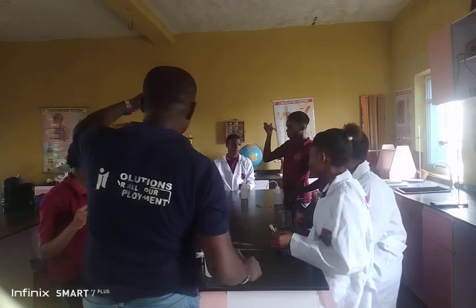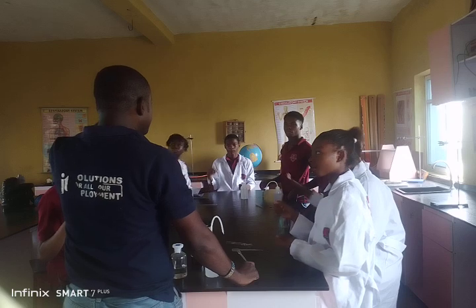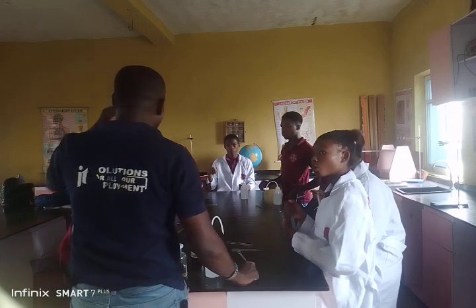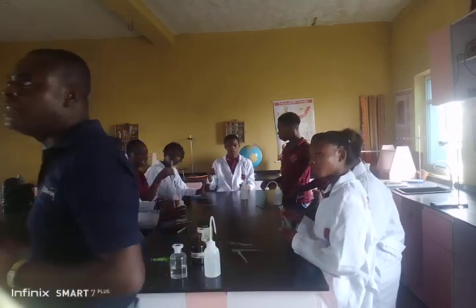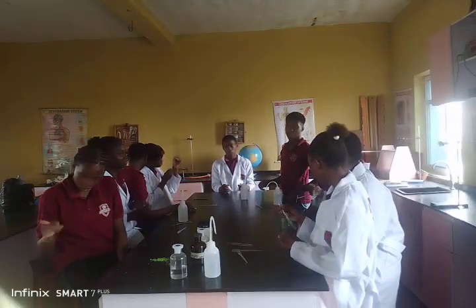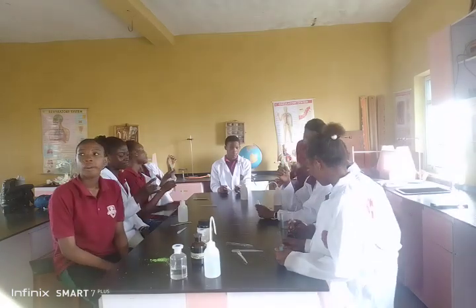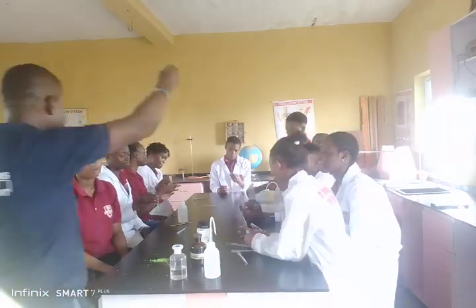So, in your table, what you will record is C plus H2O. And the observation is what? C dissolved in distilled water. And your inference, soluble salt is present. So it means your C is a soluble salt.